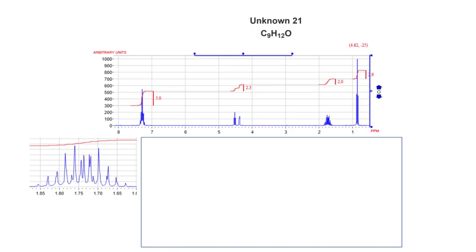Okay, how did you do? Looking at my integration again, 5 plus 2 plus 2 plus 3, 5, 7, 9, 12. That's good. It says we have an oxygen. Again, this time I'm maybe going to look at this peak here that doesn't have much splitting at all, and my first hypothesis is that's an OH. Again, if I had an IR spectrum, I would be able to look at this and immediately know if I have an OH or not. Okay, what else have we got?